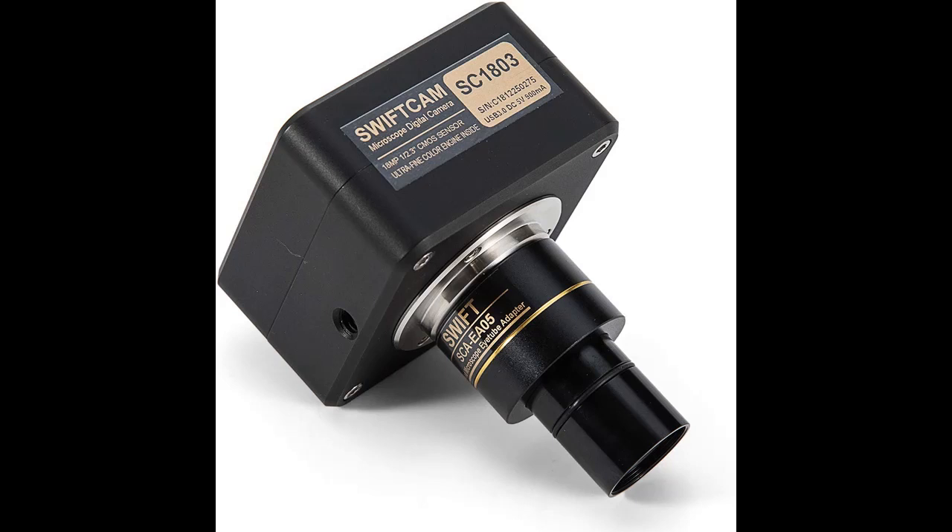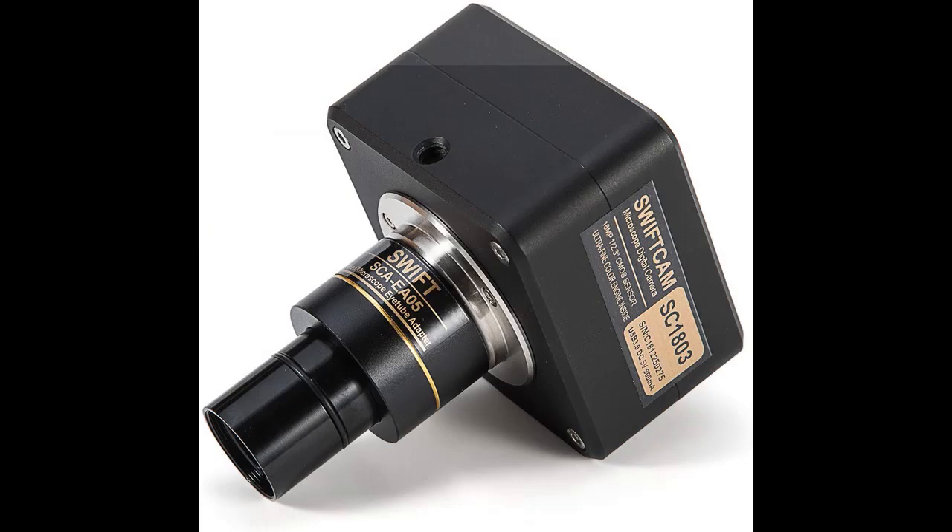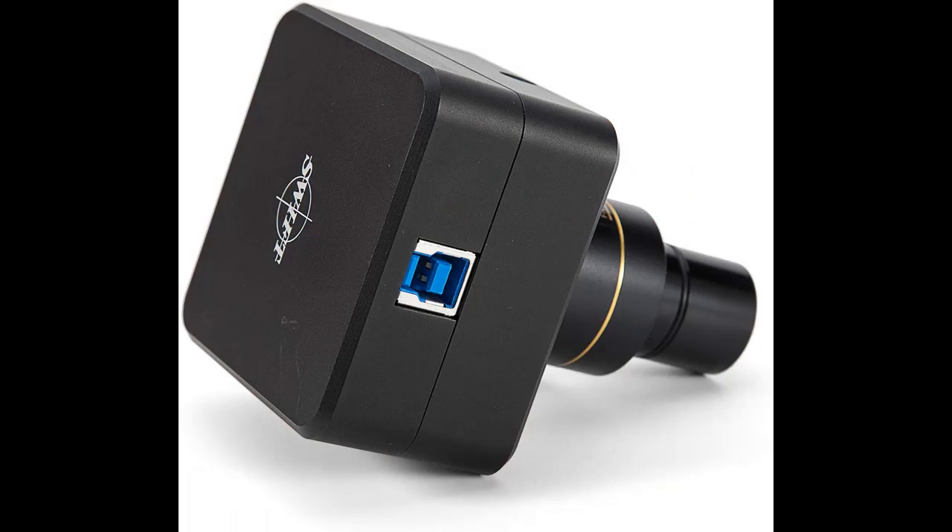Upgrade your microscope with this Swift camera, now with a whopping 18 megapixels and faster camera to computer transfer speeds thanks to the included USB 3.0 cable. Perfect for live instruction, large lectures and laboratory instruction, or for the serious hobbyist for image capture and sharing.